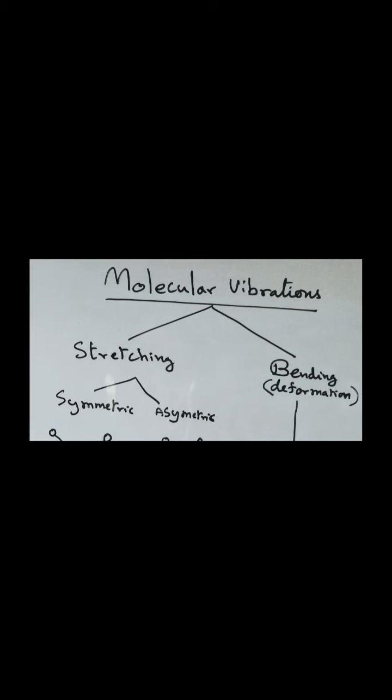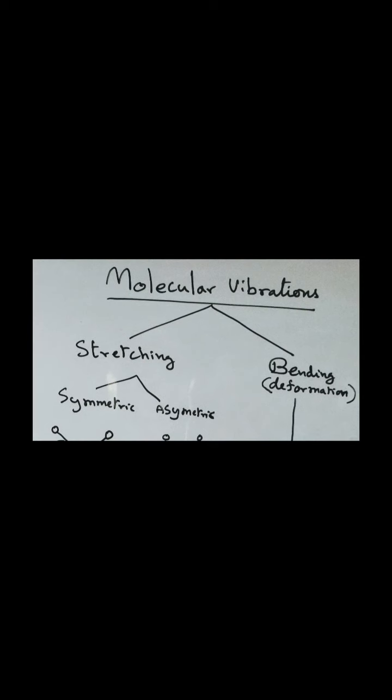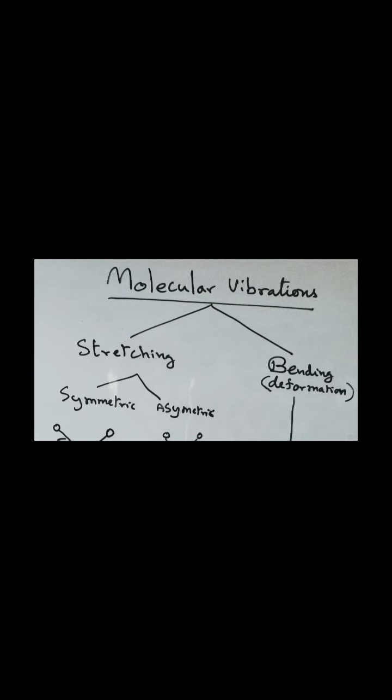As we go further, we have more atoms in an organic molecule as the molecular size becomes bigger and bigger. As the molecular size and the number of atoms become higher, the number of chemical bonds connecting the atoms in a molecule also increases. We have more chemical bonds.